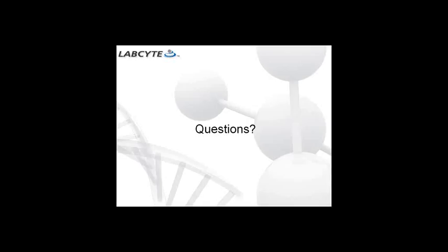Right. That's a good question. When we developed this assay, when we ran the small 32 compounds, we took that into consideration too. It takes longer to transfer enzyme, and a lot shorter time to transfer compound. So you probably want to transfer enzyme first, then add compound on top of it.